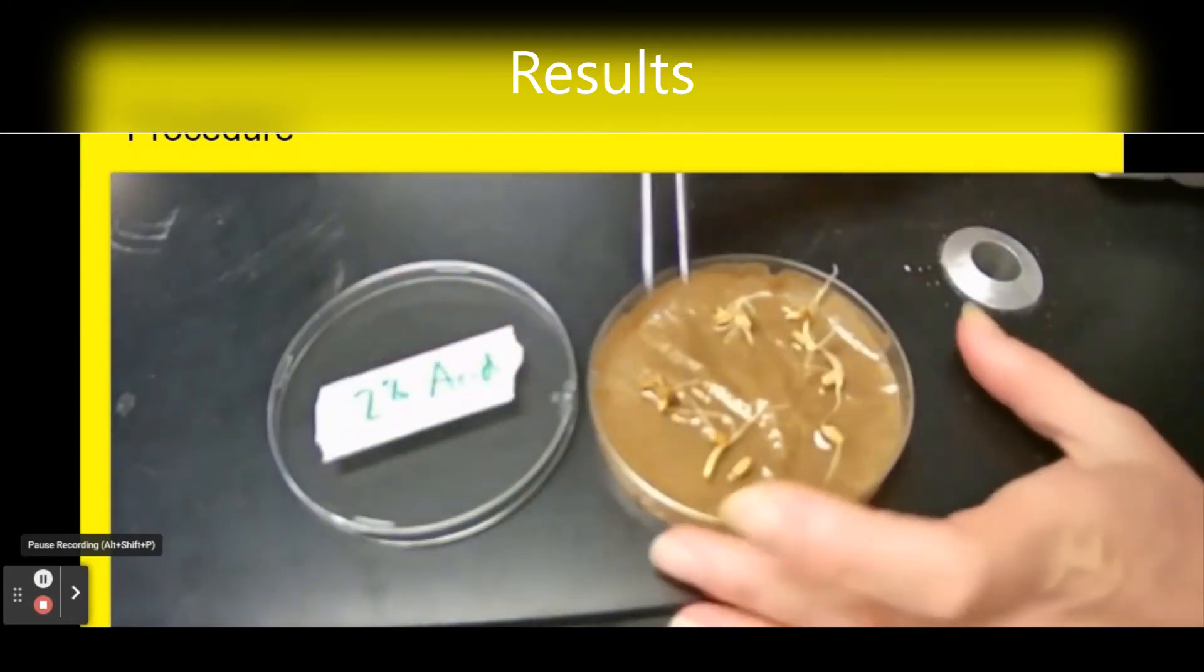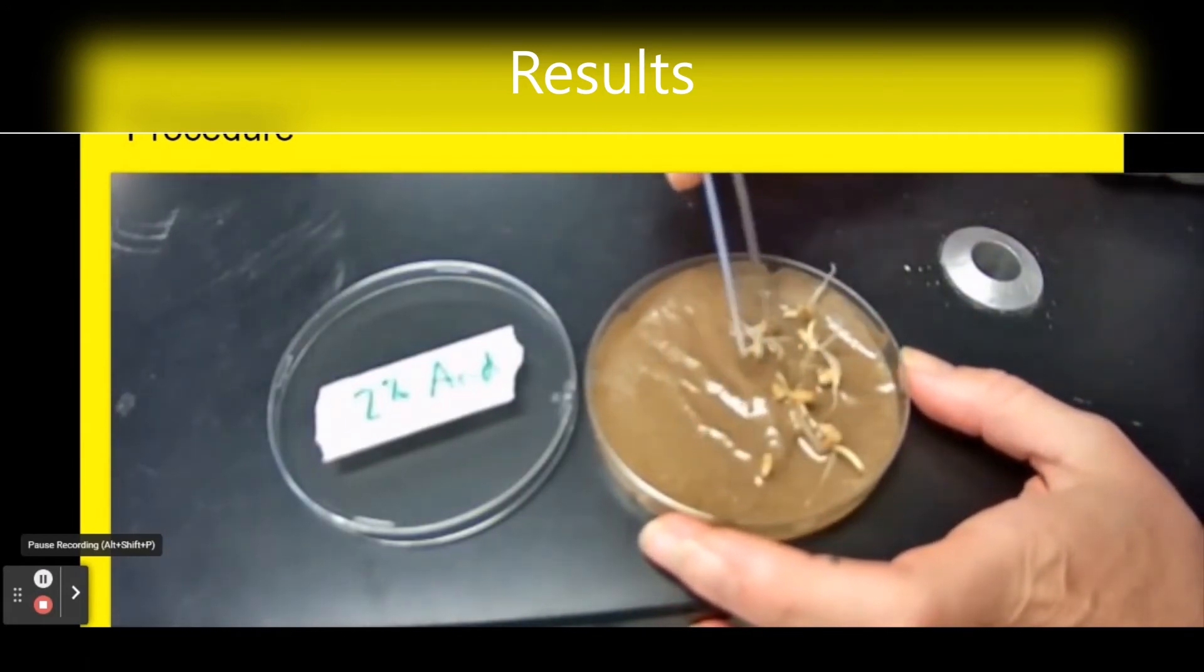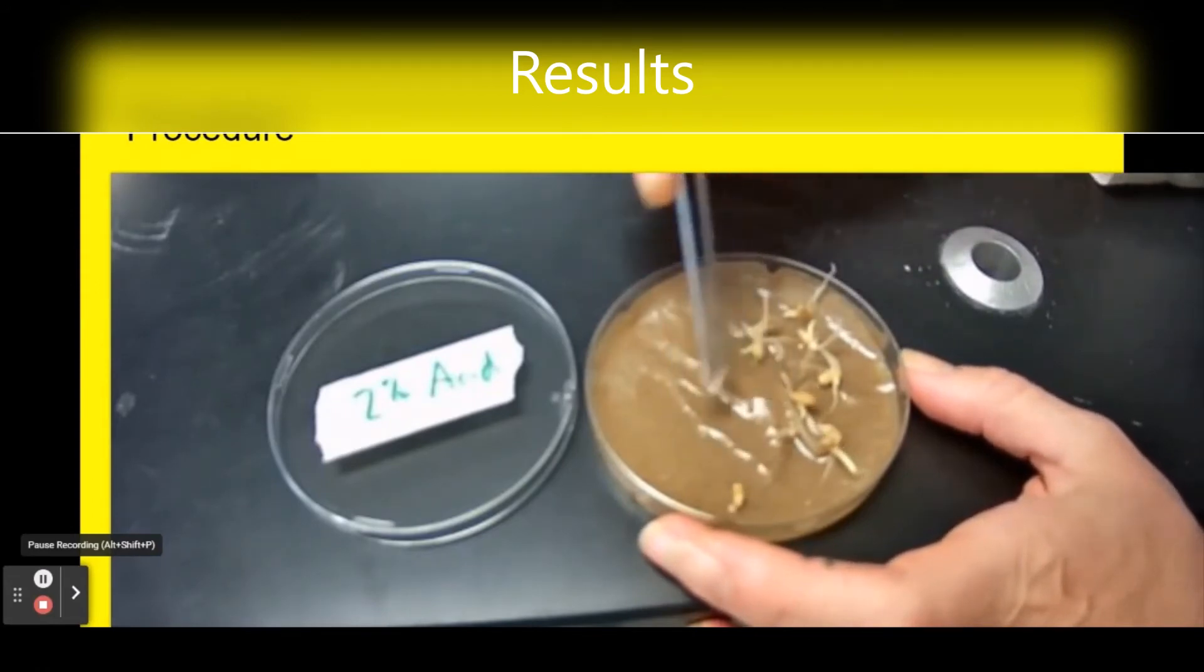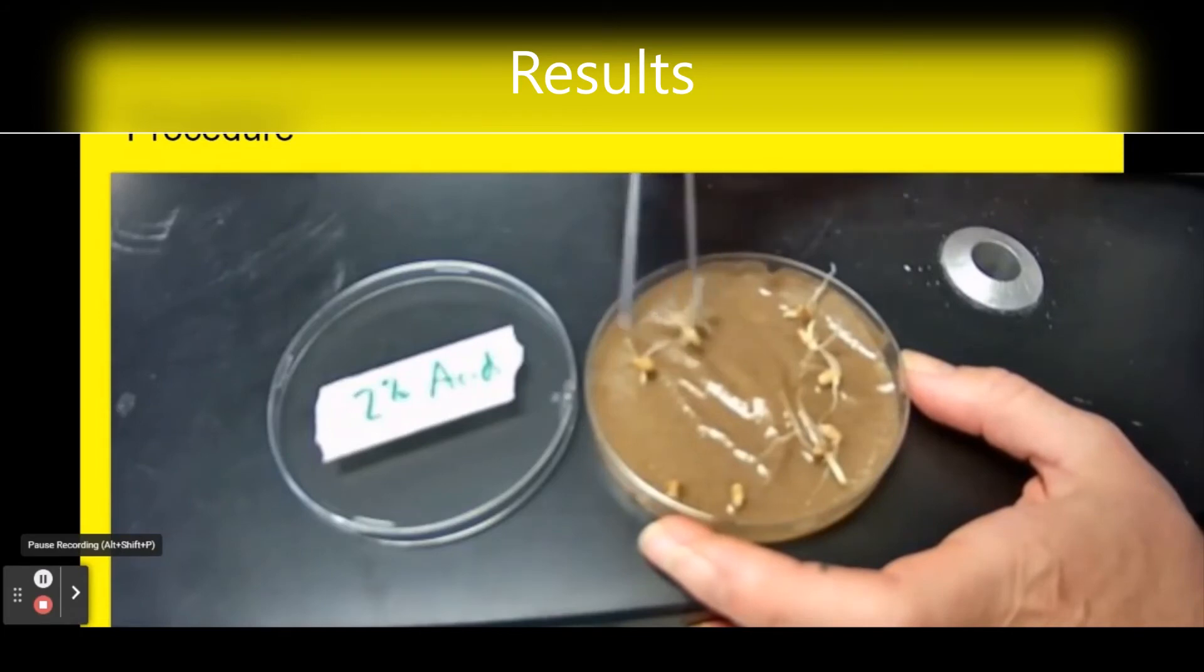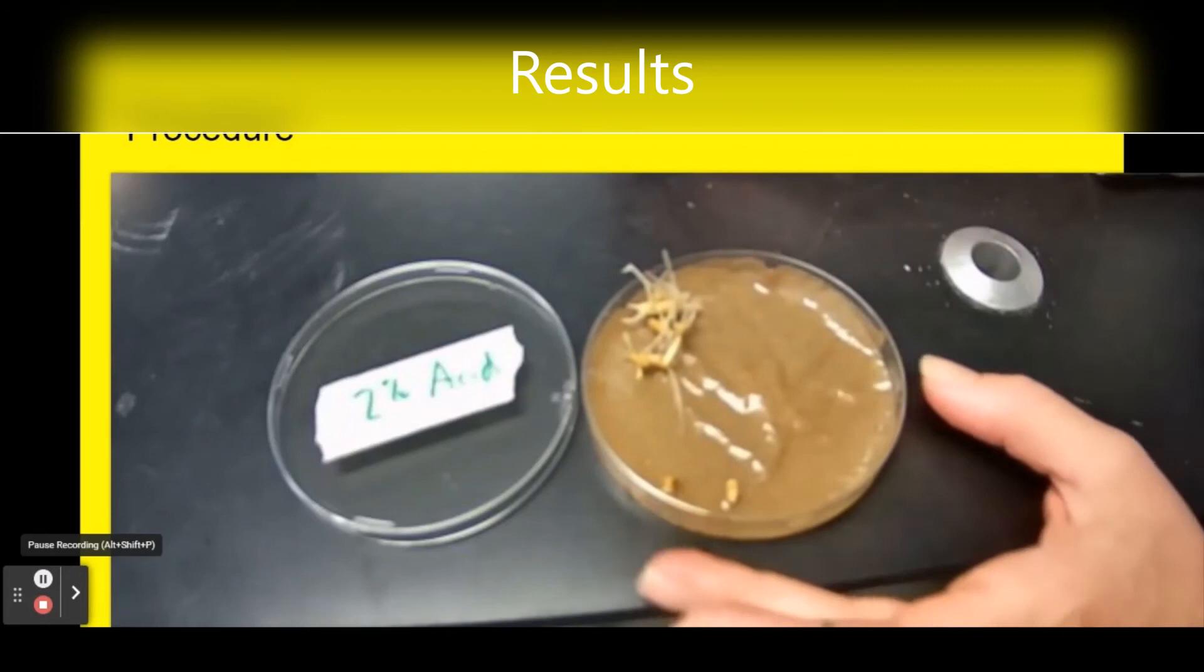Here we've got two percent acid. There's two seeds that didn't germinate. One, two, three, four, five, six, seven, eight seeds germinated and two did not.